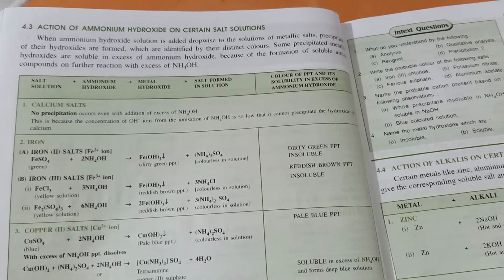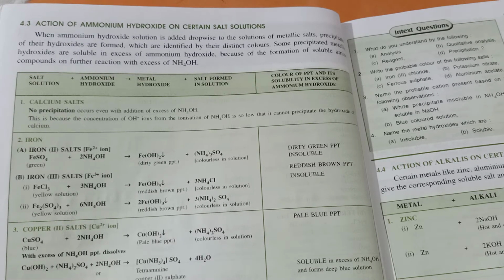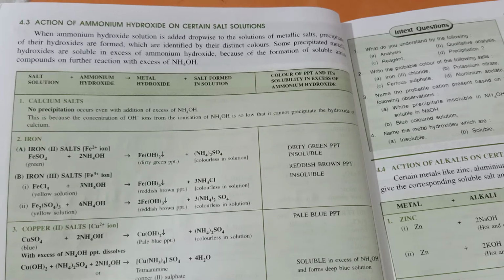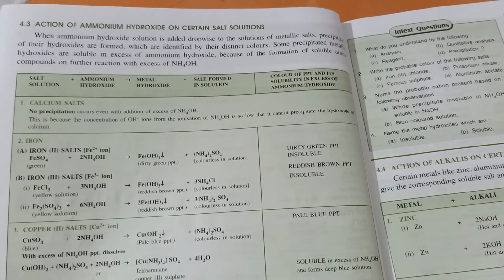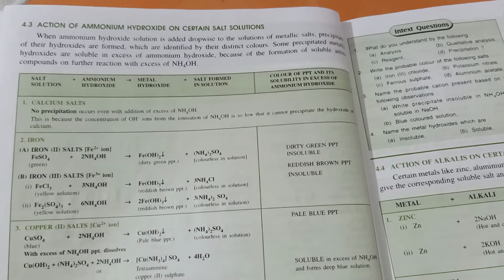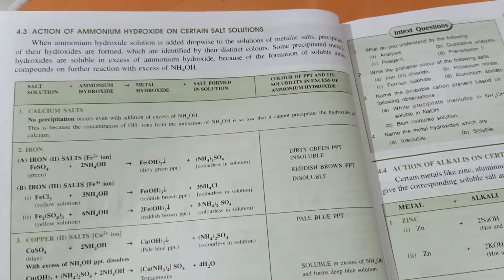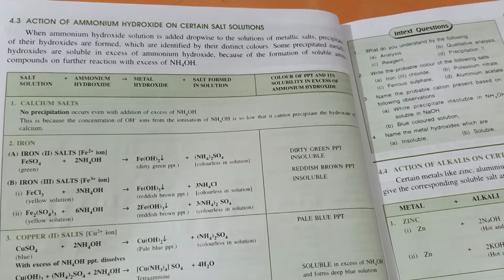So to get the precipitate properly, we have to carry out this reaction in a very meticulous method. That is, we have to do this reaction drop by drop. That means we have to add the alkali drop by drop to the metallic solution so that we can achieve the desired precipitate of the metallic salt. Therefore, now we are going to see the effect of ammonium hydroxide on these certain metallic salt solutions.